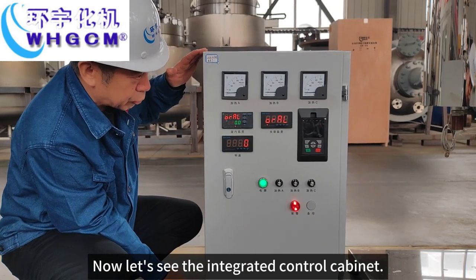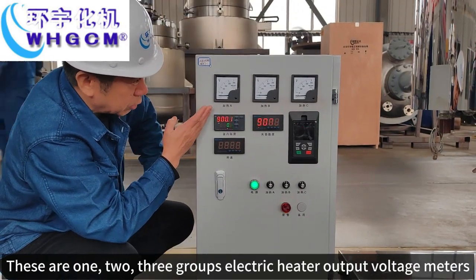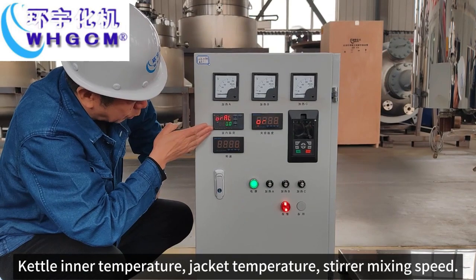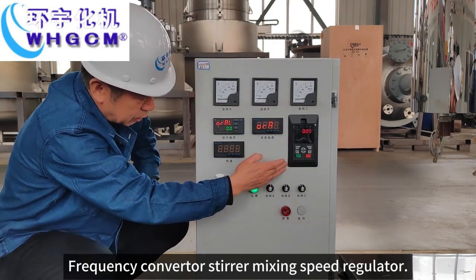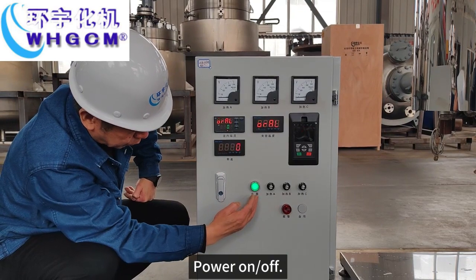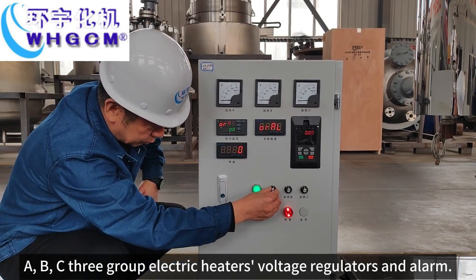Now let's see the integrated control cabinet. This shows the 1-2-3 group electric heater output voltage meters, kettle inner temperature, jacket temperature, stirrer mixing speed, frequency inverter and stirrer mixing speed regulator, power on and off, ABC 3-group electric heater voltage regulator, and alarm.